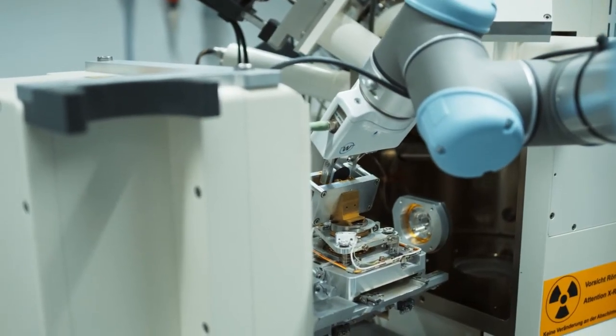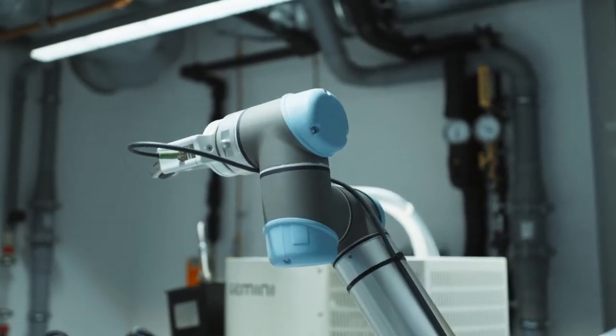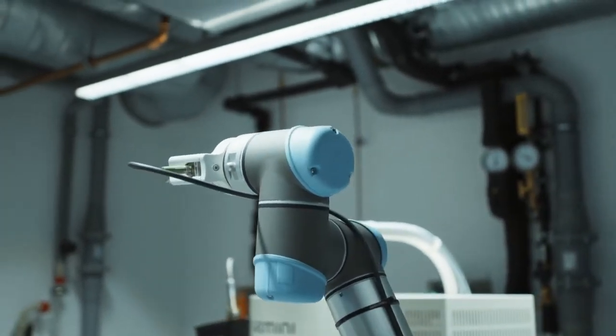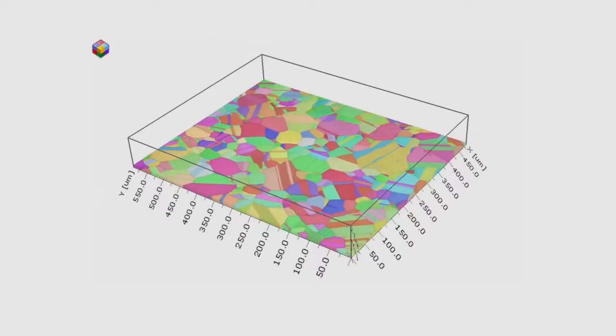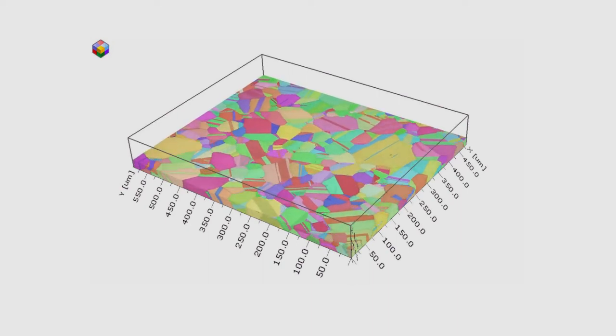So if you want to get the data from another part, what should we do? The robotic arm takes the sample back, removes a layer of it, and then repeats the process. Once we have the information from different layers of the sample, we can stack them together and this gives us 3D information of the microstructure.